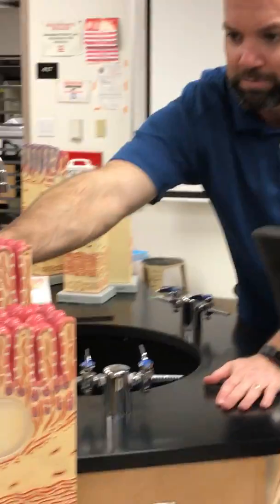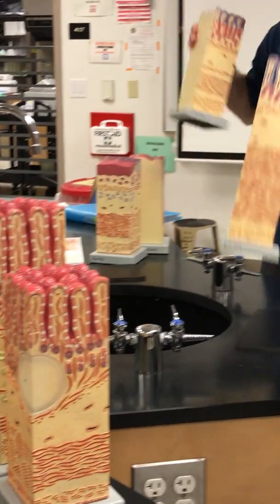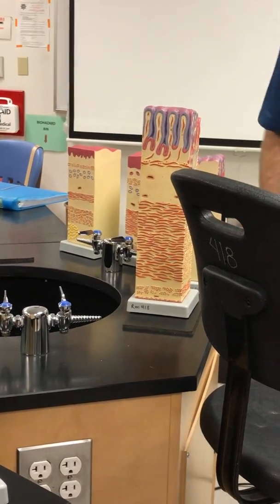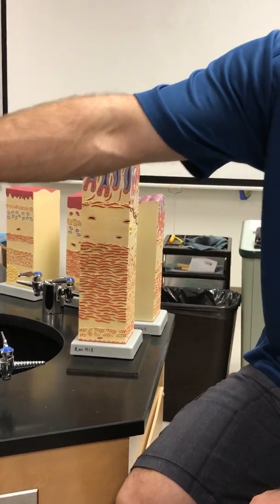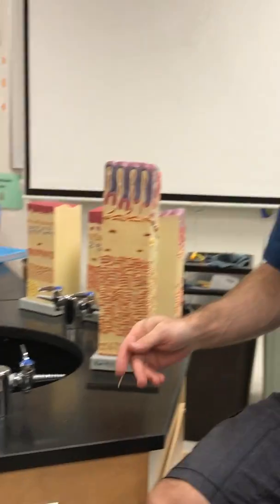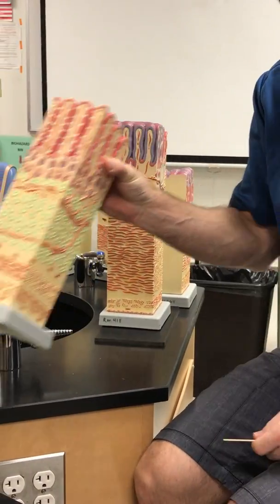This one is kind of similar to this one. Everything other than goblet is absorptive cells until you get to the very, very bottom. And then you find enteroendocrine and Paneth.